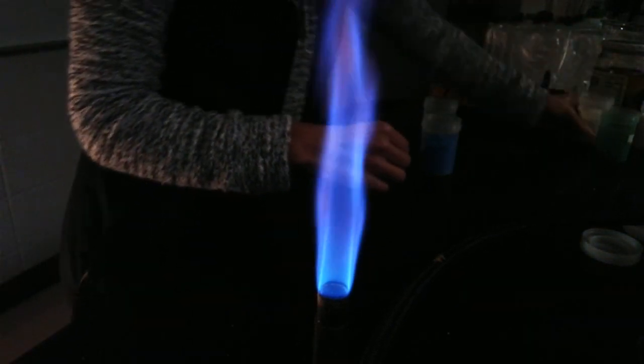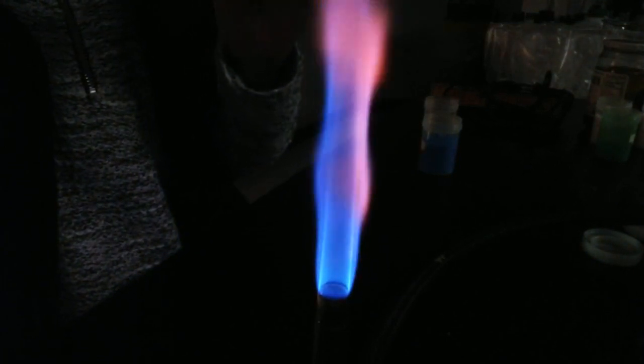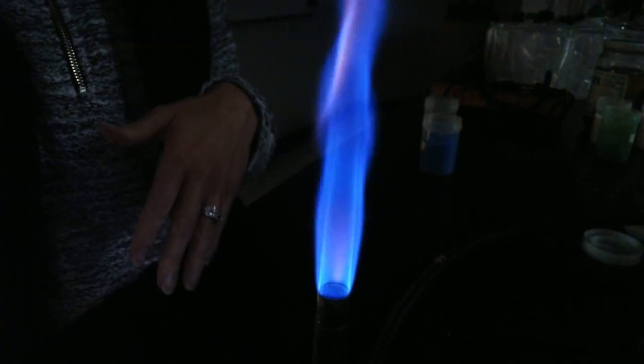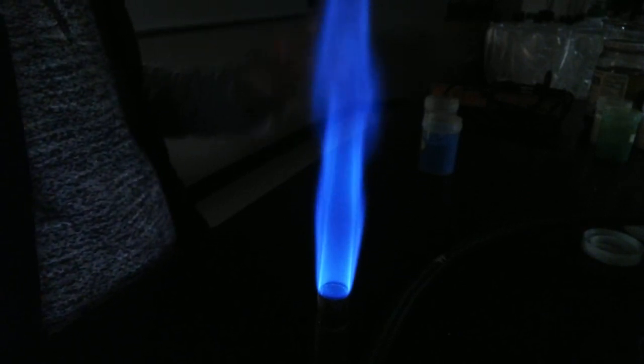Okay, so all of those were chlorides. They all had some kind of a metal like sodium, and they were all bonded to chloride. So what if I ask you this? Do you think the flame test was showing the color of the metal, like the sodium, or do you think it was showing the color of the chlorine? So we tested potassium chloride, strontium chloride, lithium chloride, copper chloride.